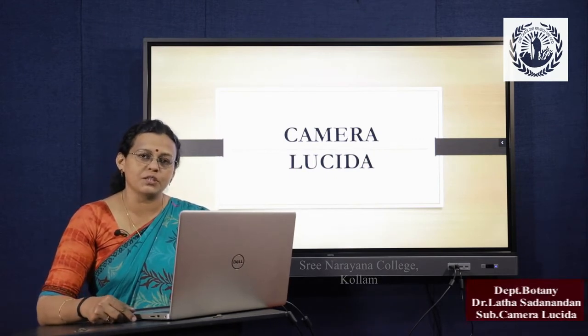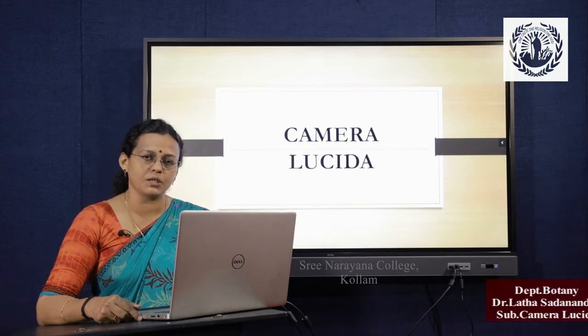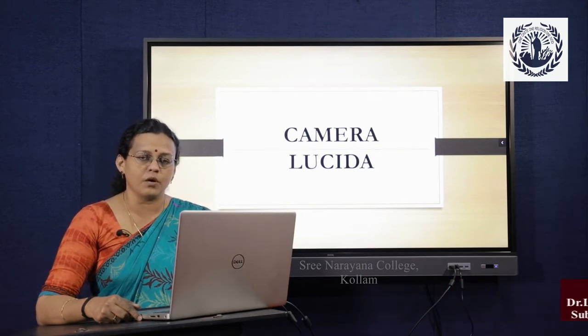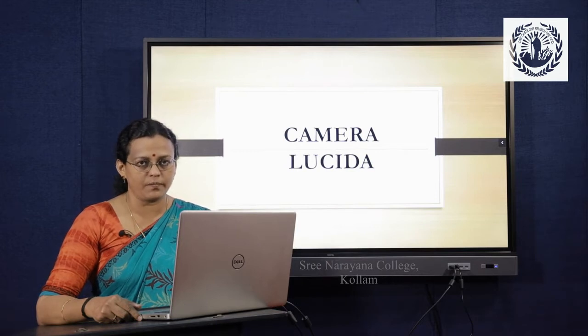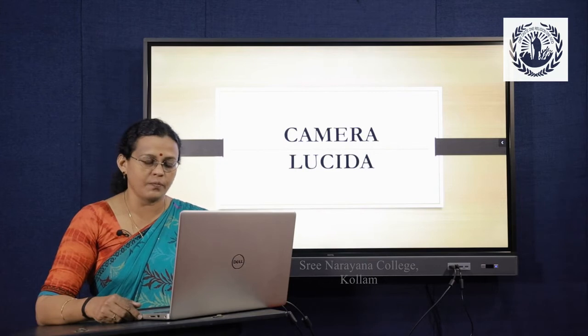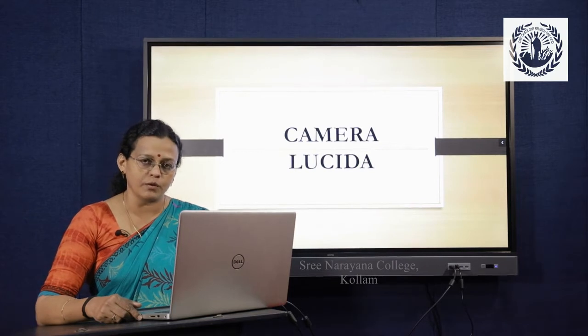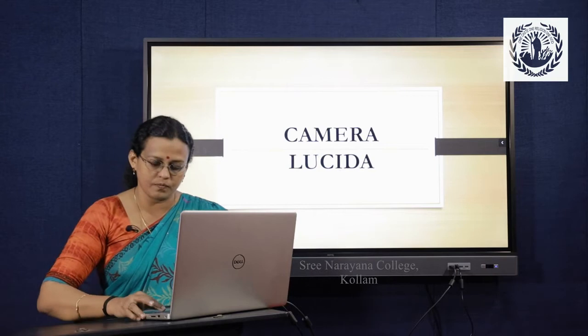Today I would like to introduce you to a topic, camera lucida. It is a topic that has been included under microtechnique in undergraduate and postgraduate programs of the different universities of Kerala. So I hope you all like drawing. This camera lucida is one such instrument which is used for drawing microscopic objects. So now let's see what it is.